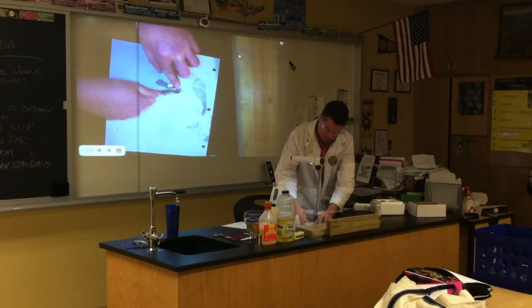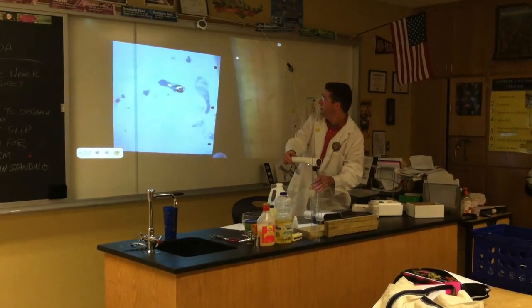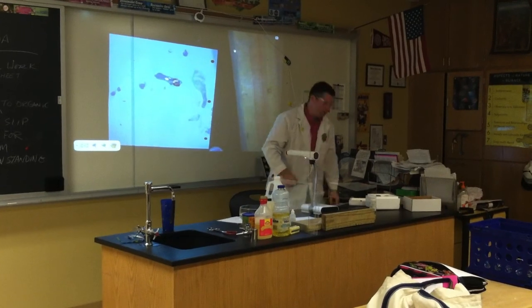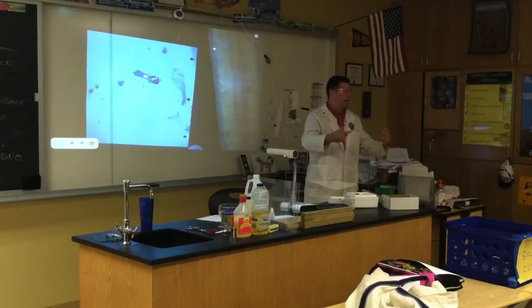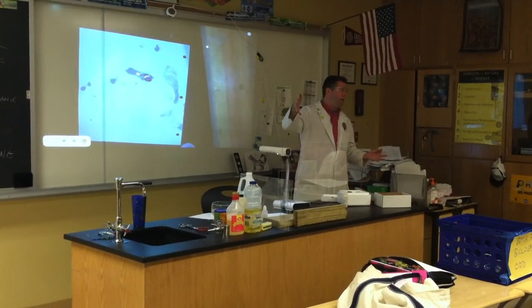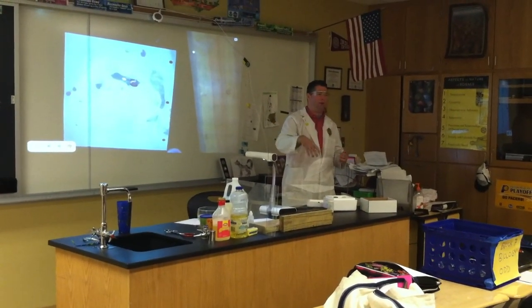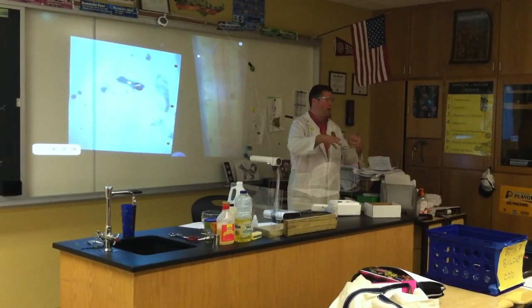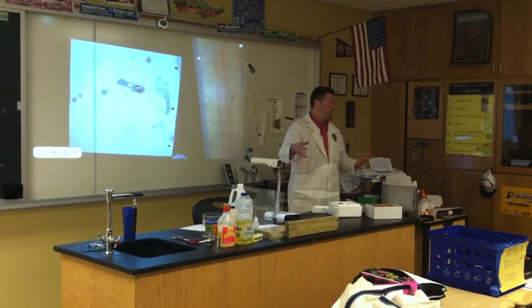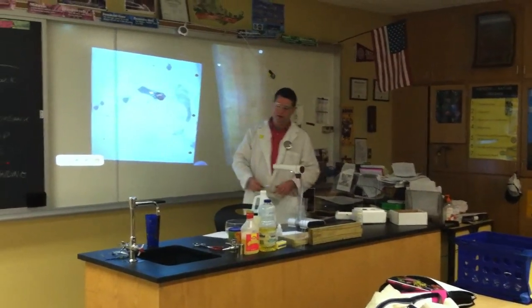So if you look at the inside, can you guys see that? Kind of like a bean. It looked like a bean. Alright, so it's actually very shiny in there. It's a metal, so it's very shiny, and if we let it go out in the air long enough, it would actually start to rust as we talk. If I wiped off all the oil, it would start rusting right away because it's so reactive. If you leave a car out, it'd take several months before you get rust on it. But this stuff would rust in the period of an hour.